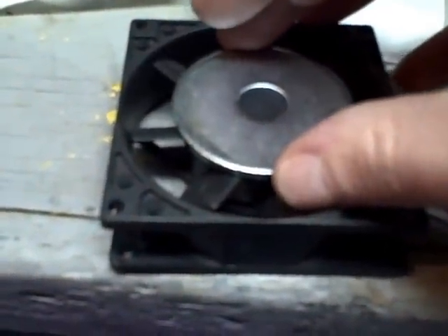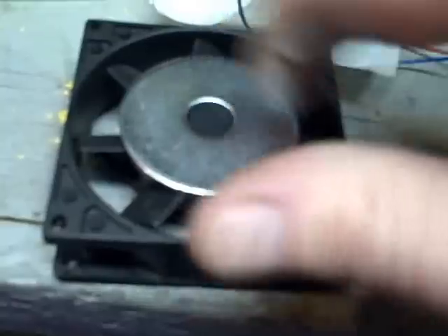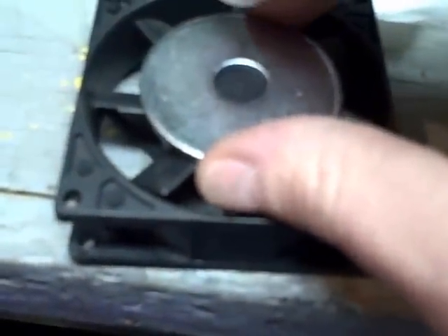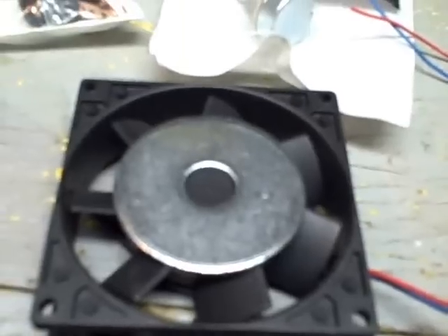A lot of people take washers and glue them to the fan. I've seen people use epoxy and different methods to get it centered — slow-curing epoxy, get the fan going and get the washer centered, and then as the epoxy sets up it's nice and centered. The reason for using a steel washer is to be able to use magnets and just place them on there.